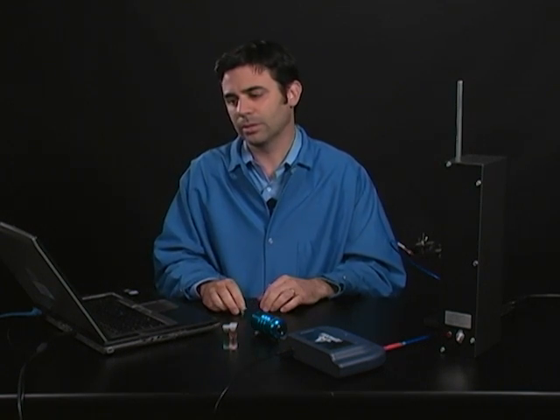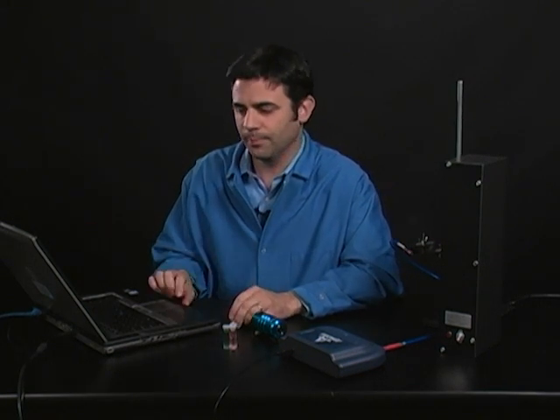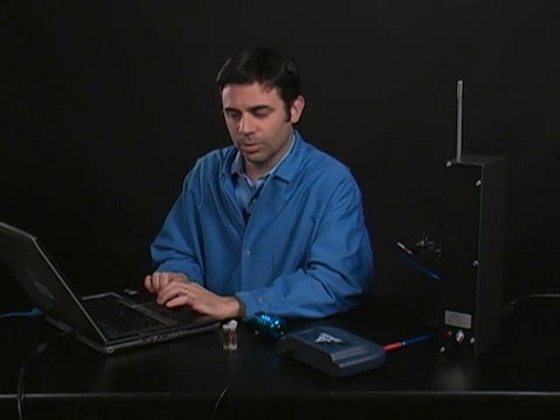So first, a little bit about how we're going to set this up. We're going to use this through SparkView, and when the Amadeus is plugged in, it automatically gives us these options: Intensity, minus dark, absorbance, transmission, and relative irradiance. We're not going to look at all of those, we're going to look at some of them.